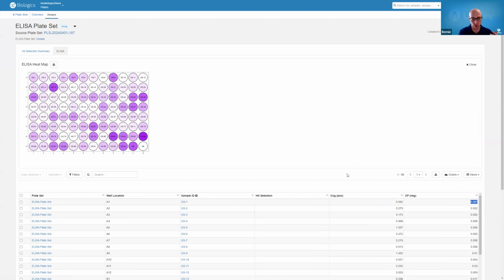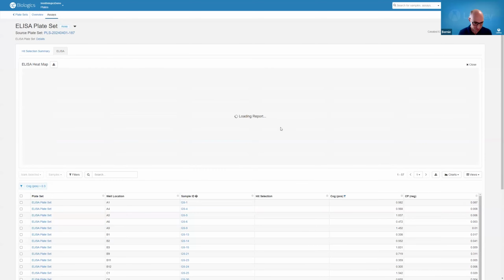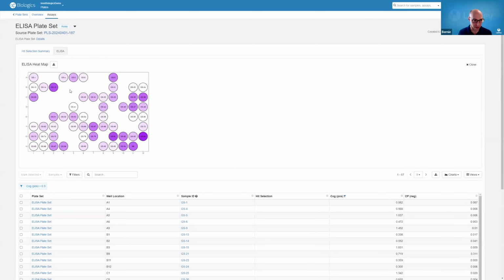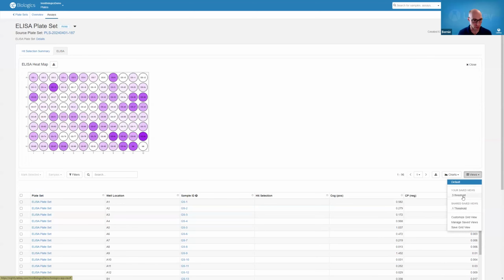But of course, what you want to do from here is your analysis and your selection, and very often in these early stages, that's as simple as having thresholds. As I change these thresholds, for example, if I want positive binding always to be above 0.3, I can set that threshold, and the visualization updates accordingly. I'm actually going to back out of that because I have these prefabricated: a 0.1 threshold and a 0.3 threshold.